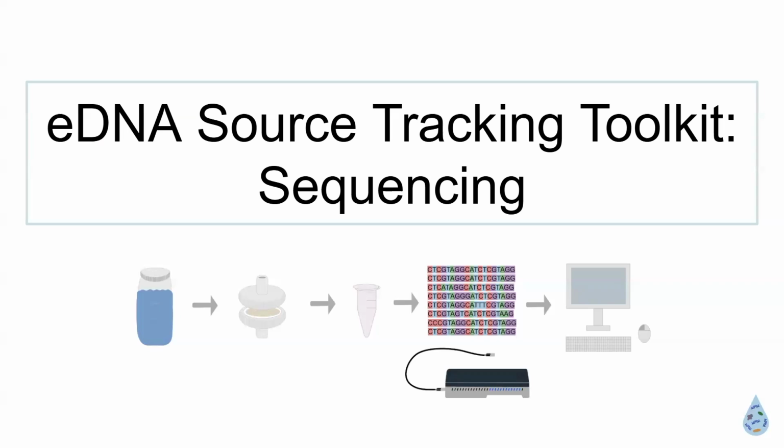There are specific kits for water extraction and for sediment extraction, so you would find a kit or a method that is for sediment. And then you would extract it and again do the sequence or the quality and the quantity checks. So just a different kit and no filtering.